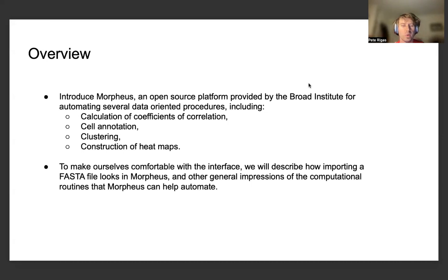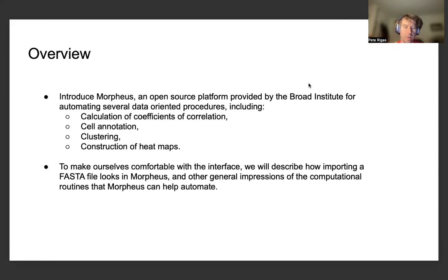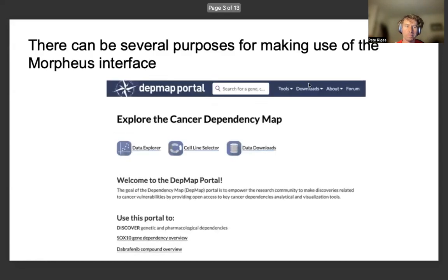To make ourselves comfortable with this interface, we'll be describing how importing a FASTA file looks in Morpheus, and how the computational routines that Morpheus can help automate are useful for analyzing FASTA files with thousands or potentially hundreds of thousands of sequences. There can be several purposes for making use of the Morpheus interface.